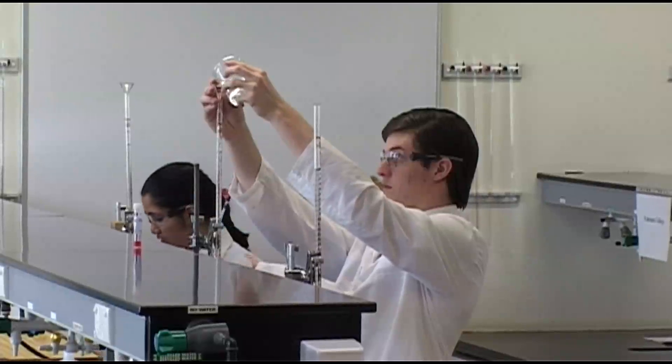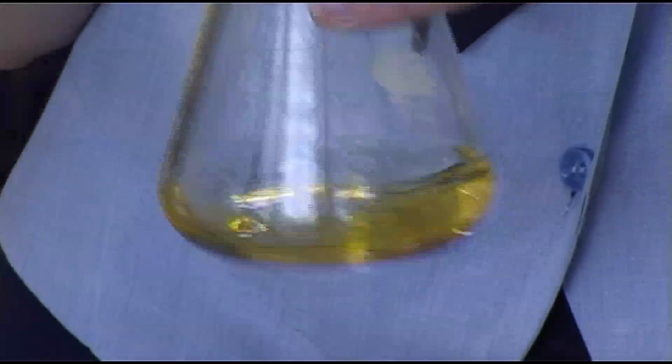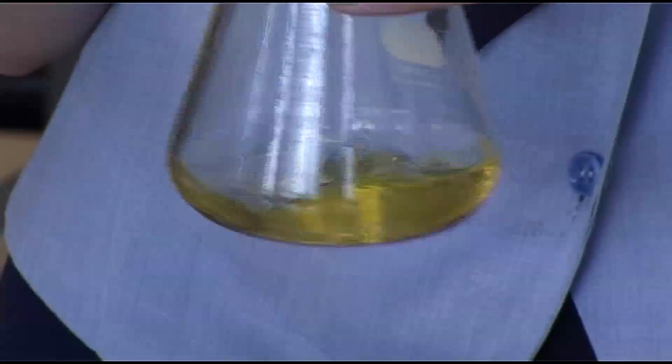If you get the first one wrong, then the acid that's unknown is way off, so that's what makes it really intense. It's the same procedure we've done in class for our EEIs — extended experimental investigations — so we can just apply it to this situation and change the reagents around.